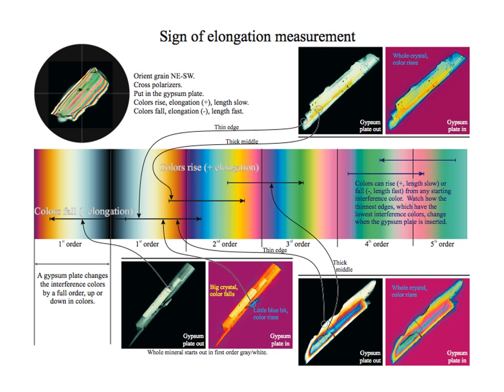So this handout is one I gave you in class. It has the whole interference color chart, and on the left side the chart has been extended into negative values to show a mirror image. Remember that birefringence is an absolute value, so so-called negative interference colors are just duplicating the positive ones. It just means that what was previously the slow ray, when you add the accessory plate, has caught up and become the fast ray, has passed what had previously been the fast ray.